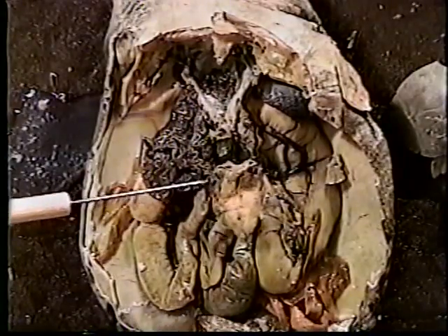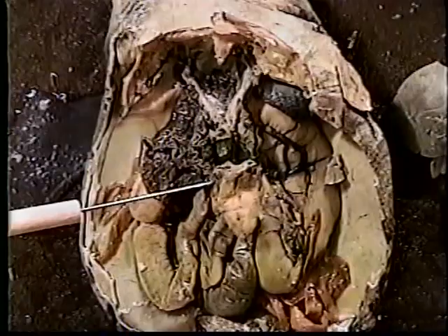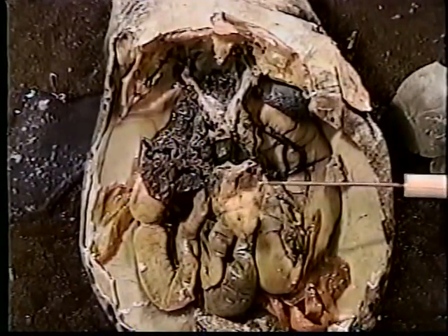The right auricle collects blood from all areas in the body. The left auricle collects blood from the lungs. Both auricles contract and send the blood that they are holding to the ventricle. The ventricle then contracts and sends blood to all areas of the frog's body.